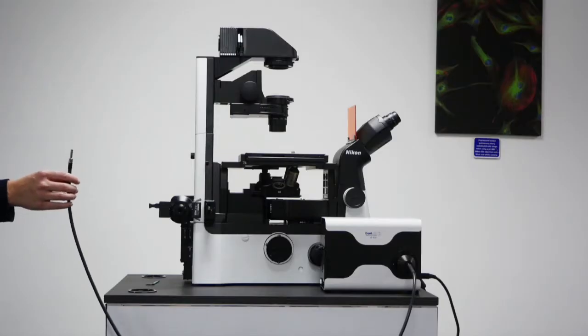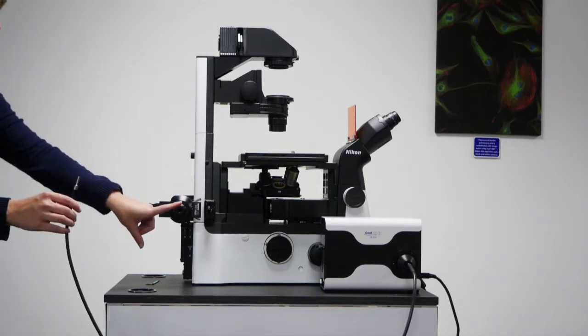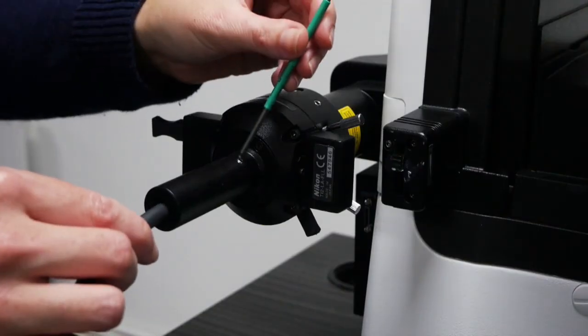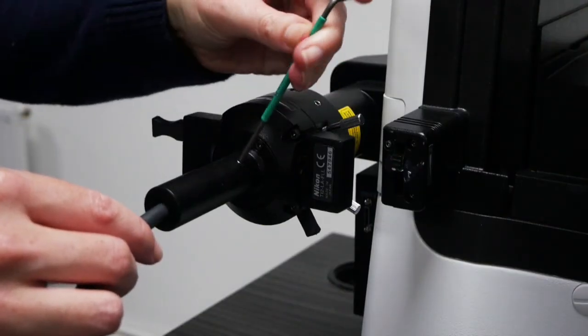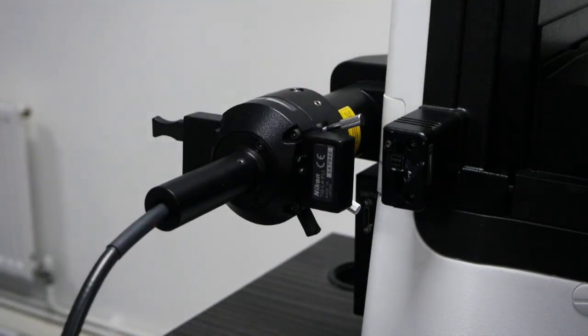For the standard configuration of the Nikon Ti2, there is just a single liquid light guide port. Simply insert the liquid light guide into the port and tighten the grub screw with the hex key.